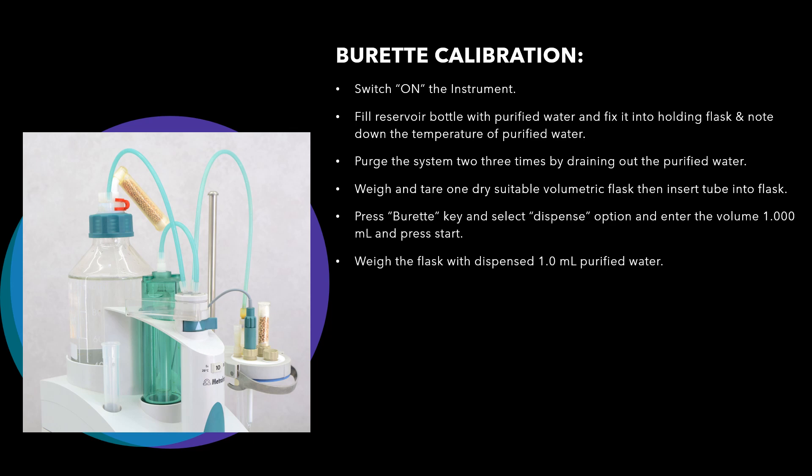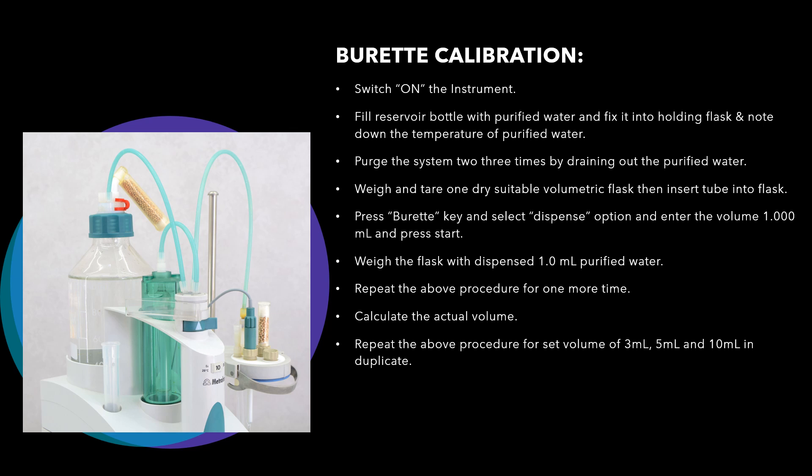Press the start button. Once you press start, 1 ml of purified water will be dispensed into the volumetric flask. Then weigh the flask again and write down the weight. Repeat the above procedure one more time. Based on this data, calculate the actual volume. Then repeat the procedure for set volumes of 3 ml, 5 ml, and 10 ml, all in duplicate.